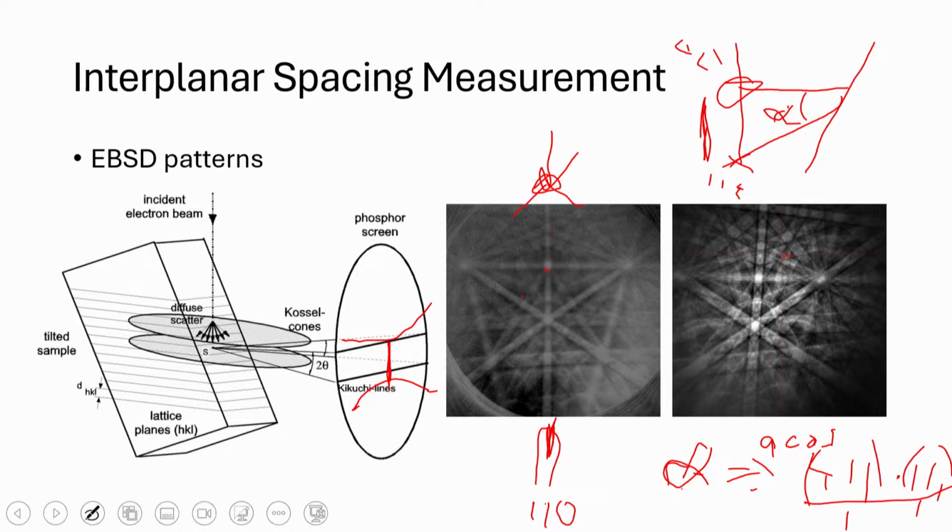This one's going to be a 211 type. This is going to be a 111 type. Okay, so 411, 211, 111. If we keep going down, that's a 332 type. And all the way further down is going to be another 110. This is 110, this is 110.